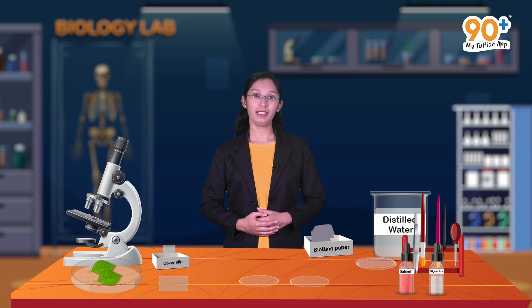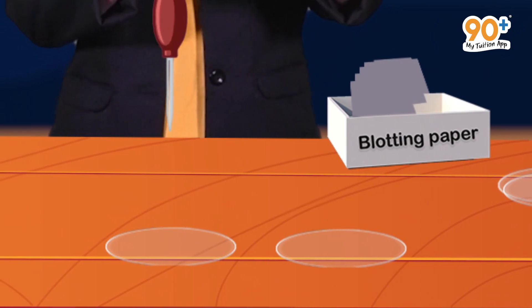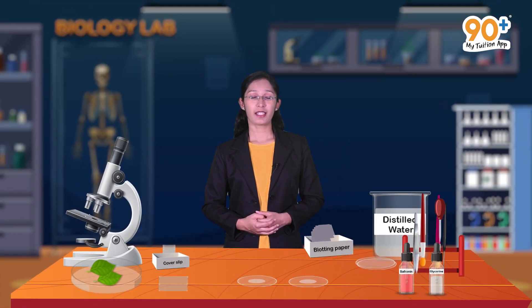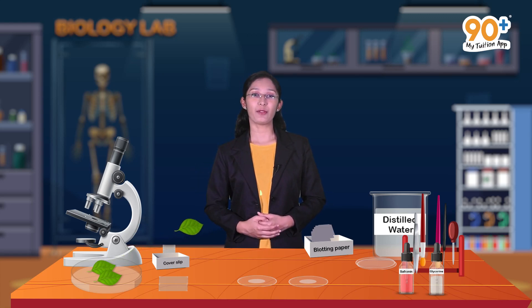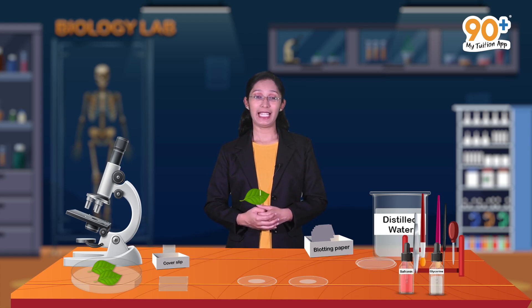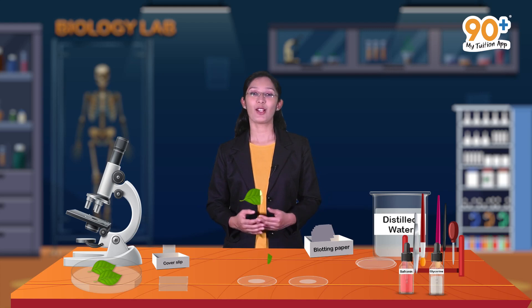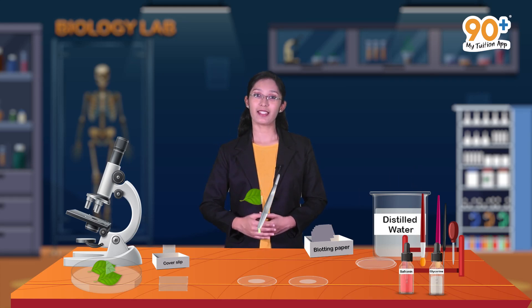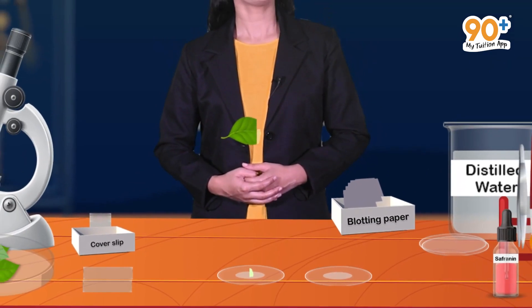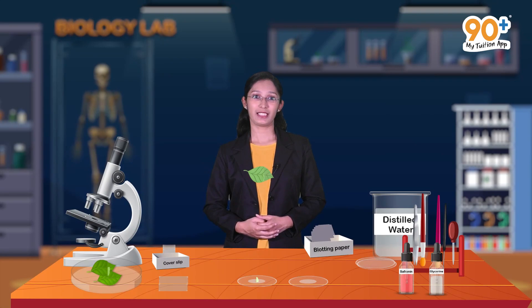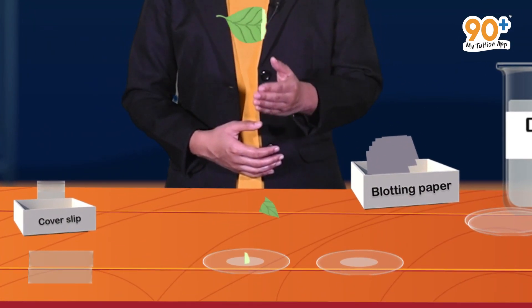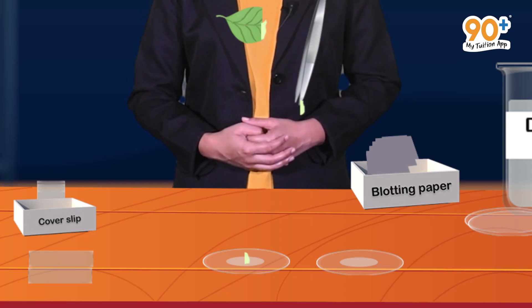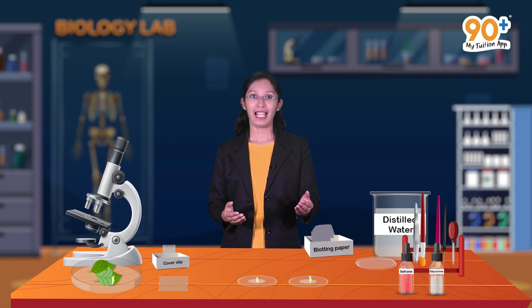Using a dropper, collect a few drops of distilled water onto two watch glasses. We shall carefully take the peel from the upper surface of the petunia leaf — we can tear the peel from the upper surface. Then with the help of forceps, transfer this peel to a watch glass. We can also take the peel from the lower surface by tearing it, then transfer it to the second watch glass using forceps. Now we have obtained the upper and lower surface peels in two separate watch glasses.